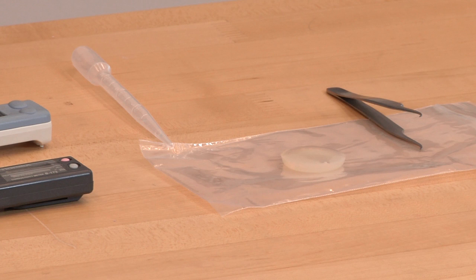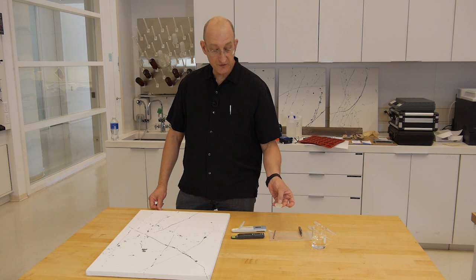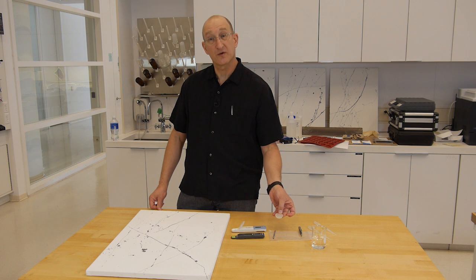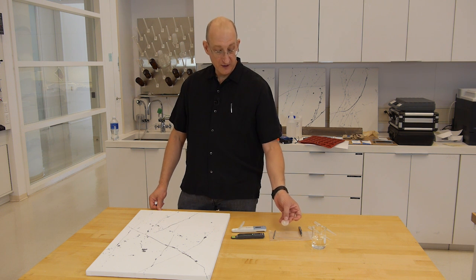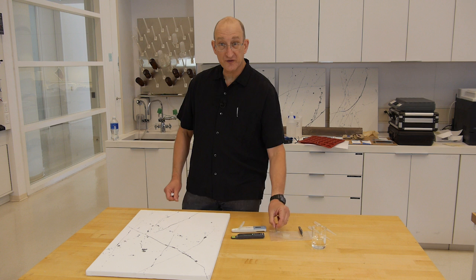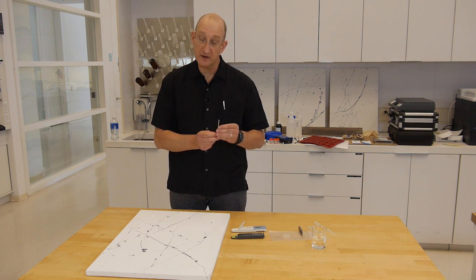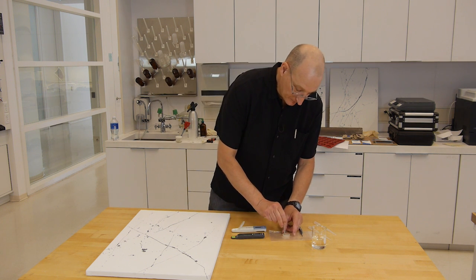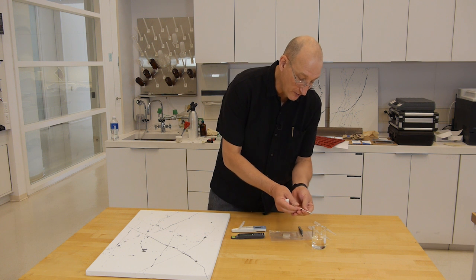The better way to take a surface pH conductivity measurement is to use an agarose stiff gel. This is 4% agarose in distilled water with a small amount of preservative in it. What we need to do is cut little plugs of the agarose using a little punch. And typically, you do a number of them.